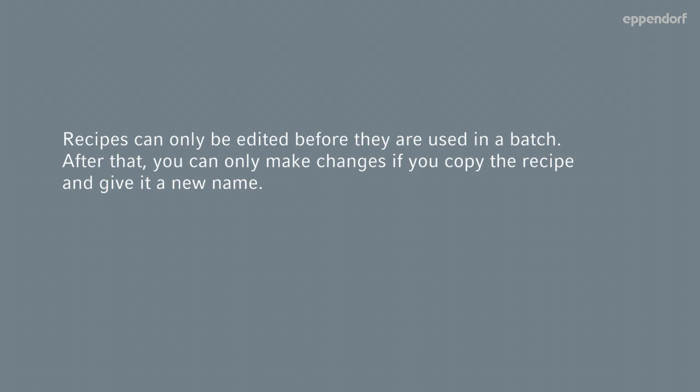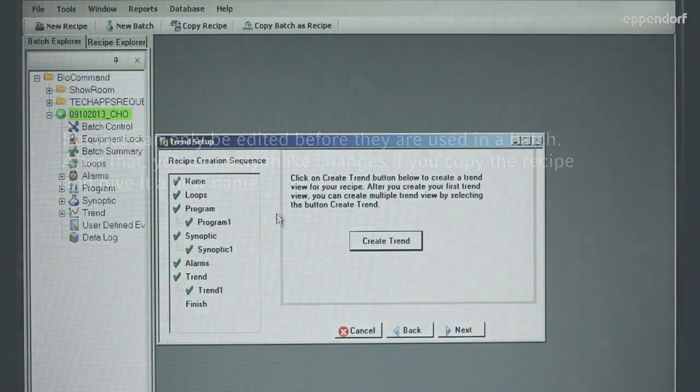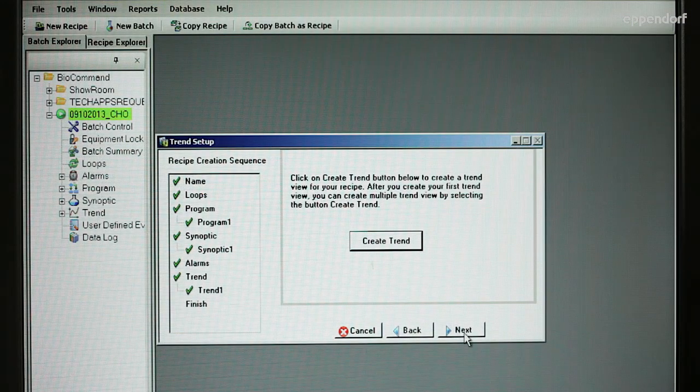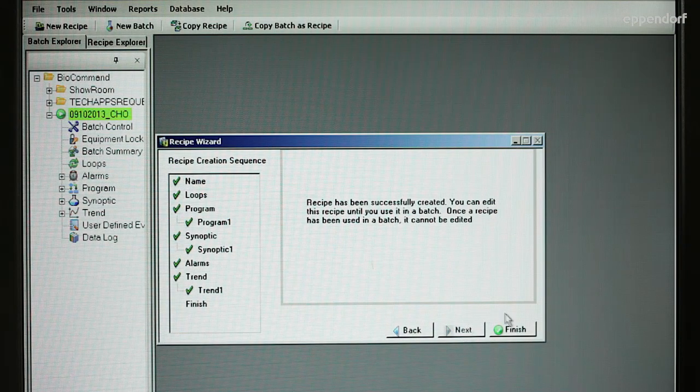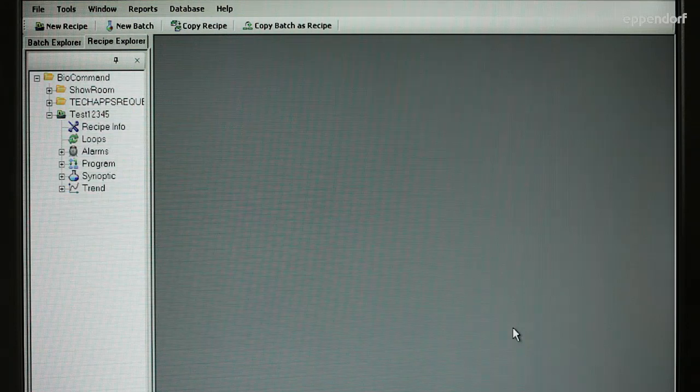Recipes can only be edited before they are used in a batch. After that, you can only make changes if you copy the recipe and give it a new name, so be certain to make final edits and then click the Finish button in the Recipe Wizard screen.